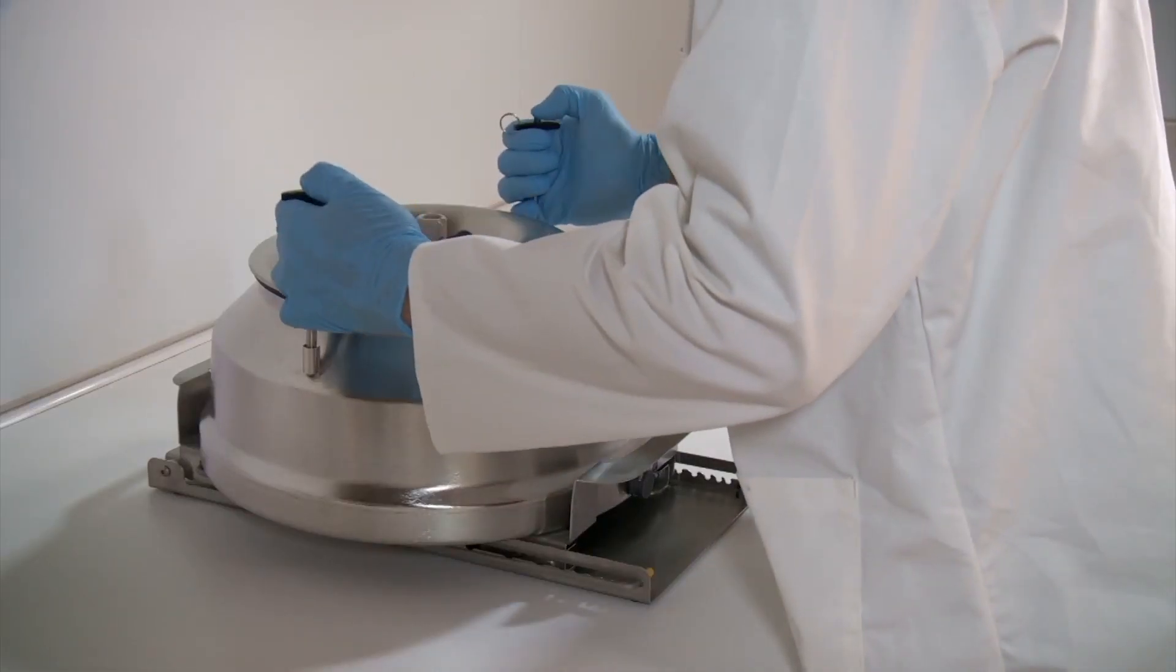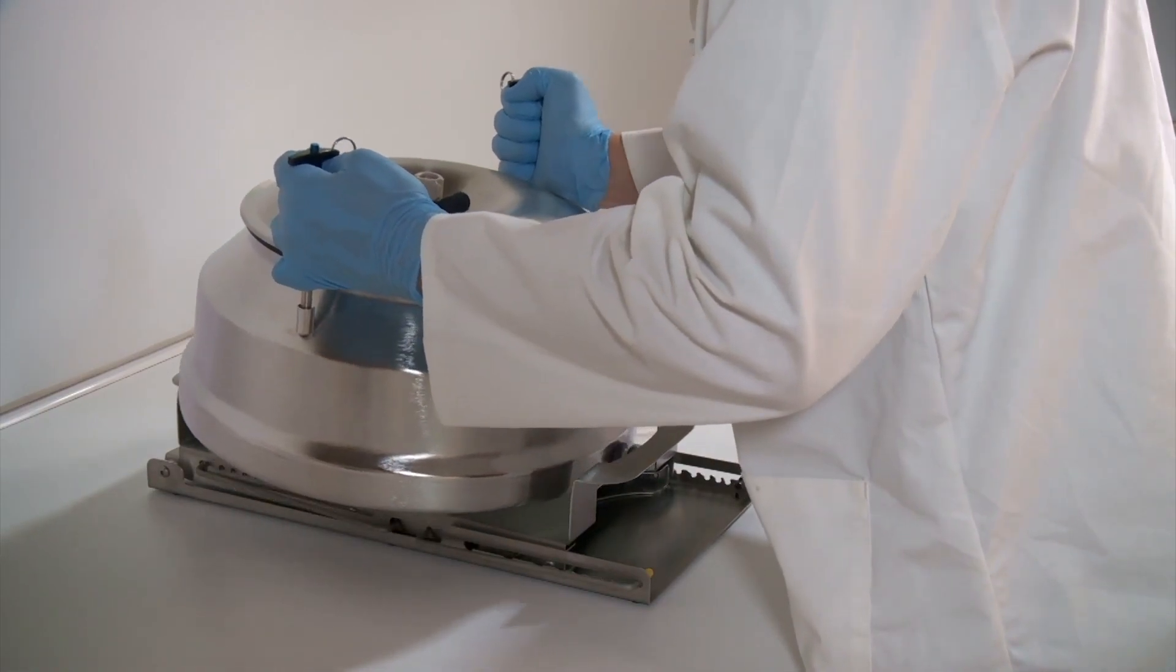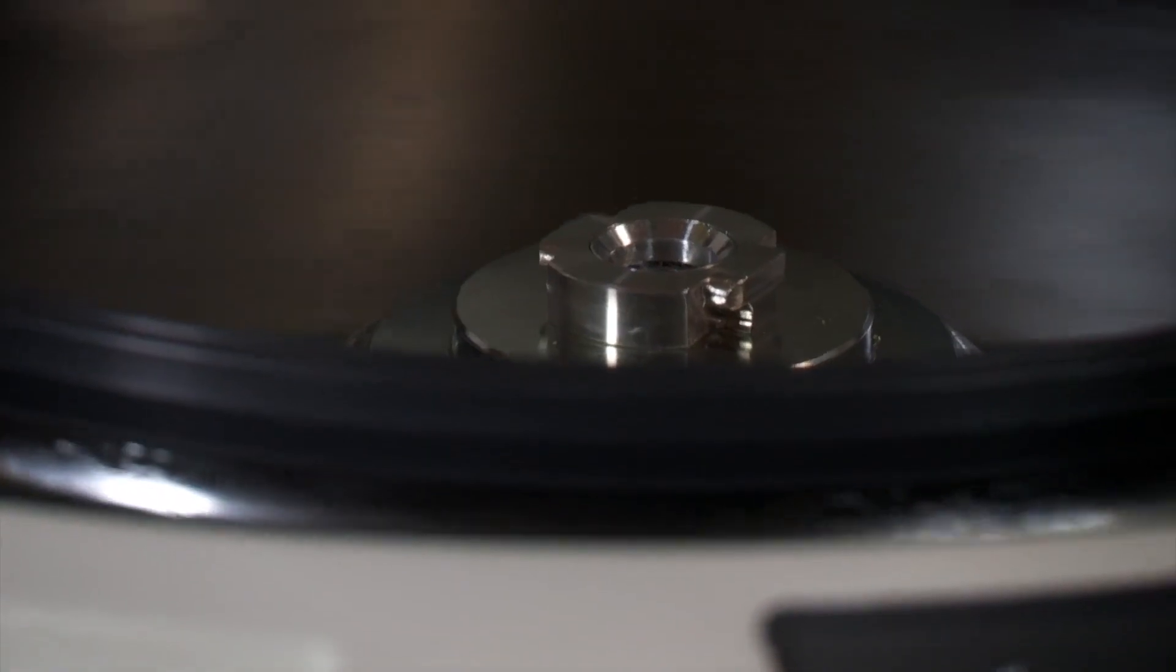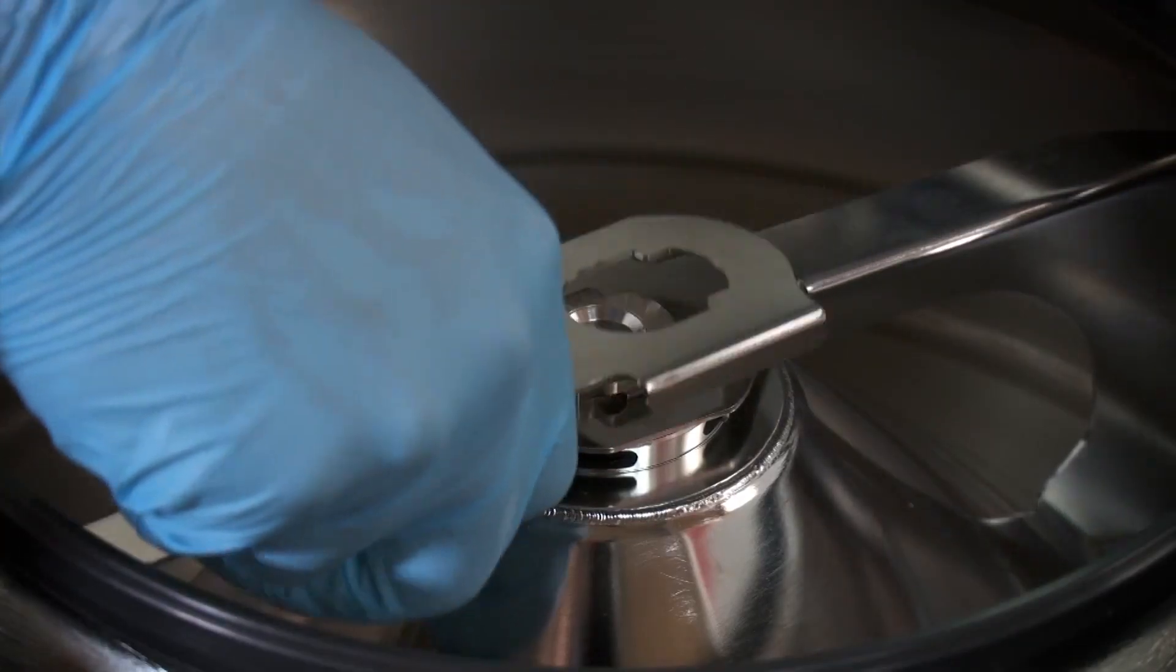Replace the flask rotor with a stainless steel evaporation vessel or bowl rotor and the rocket synergy is capable of larger volume batch processing of up to five litres.